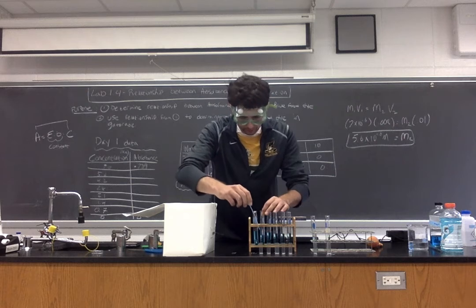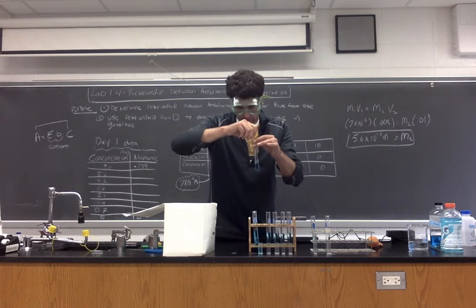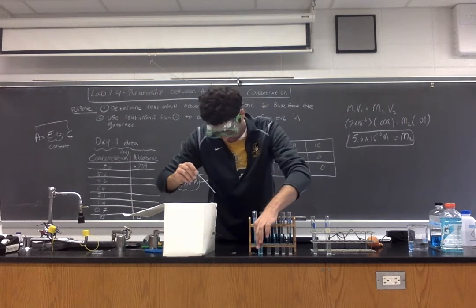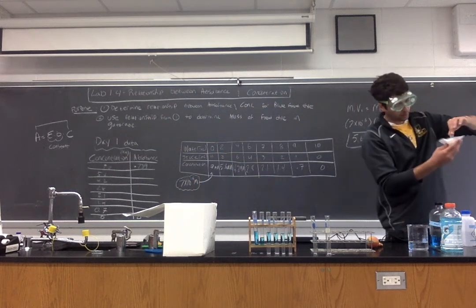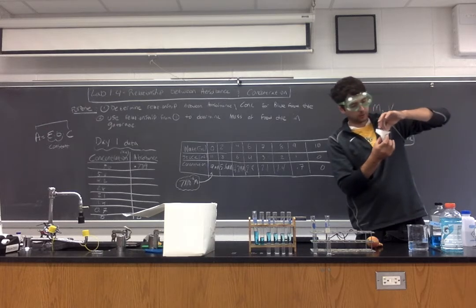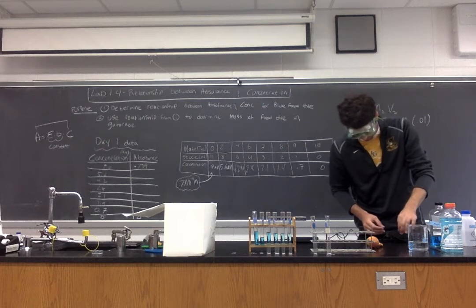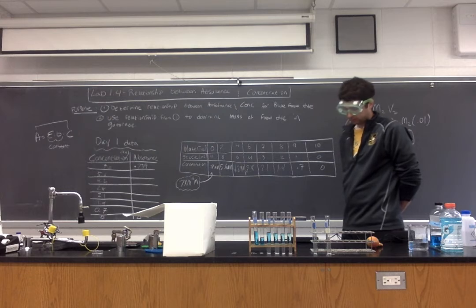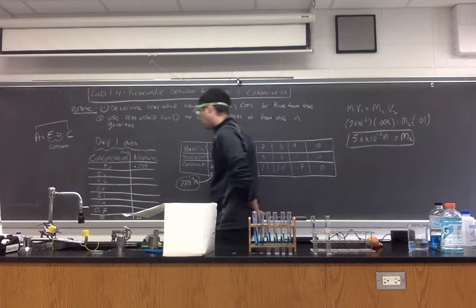What do you think is going to happen to the absorbance? Wipe off any fingerprints. 0.594.